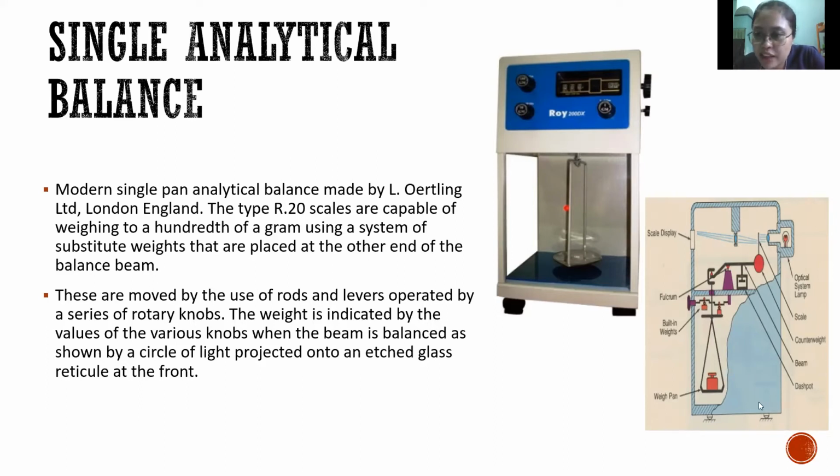And paano siya maghatag og reading, since naa siya yung mga built-in weights dinhi, mag-determine pod siya kanus magpantay tong weight na sa imuhang gibutang and sa mga weights na naka-built-in. So pag magpantay na ilang weight, meaning na reading for your object. So musiga na iyahang light and then it will give you again the measurement sa display. It's the single analytical balance.